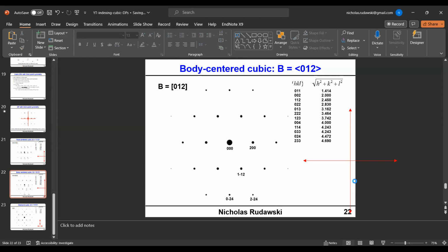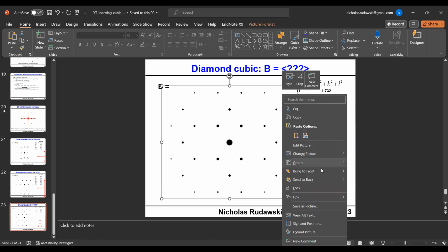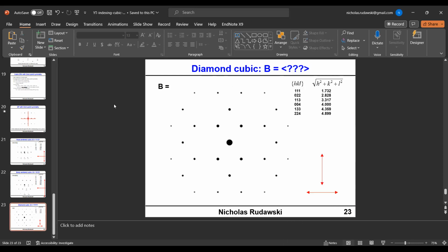All right. So we got one more example here. I saved this one for last deliberately because this is the cat daddy of them all. This is what I like to say: this is the most studied zone axis by TEM ever. This is the 110 family zone axis for diamond cubic, and specifically as studied for silicon. Although again, the way I've been doing these simulations, I've just been doing them for some nondescript structure. But for any diamond cubic structure, the zone axis for this would look the same.